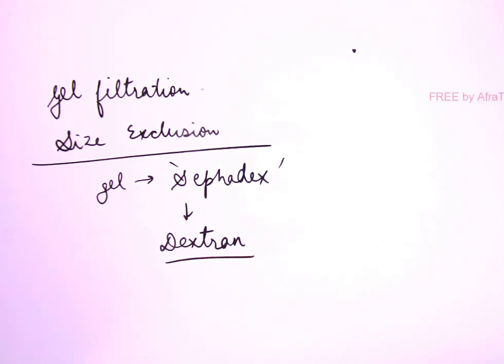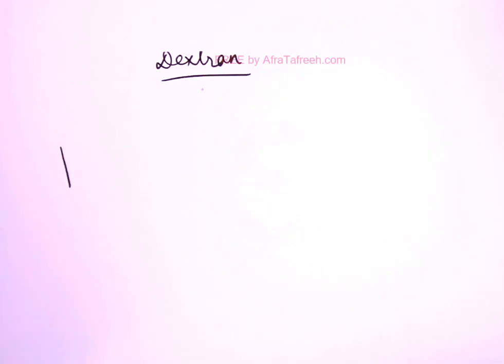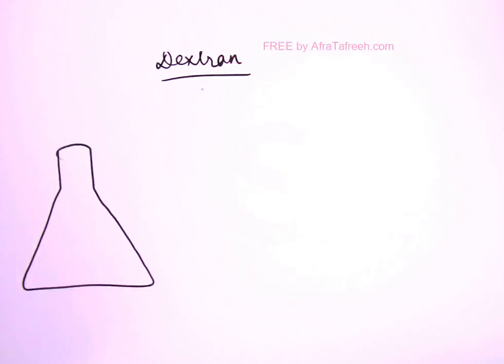So we're done with gel filtration chromatography, which is one type of chromatography. Let's take another kind of experiment in this case. Again, I'm giving you a flask, and in this flask, I'm giving you a mixture of proteins.